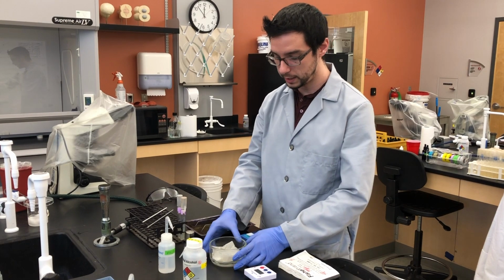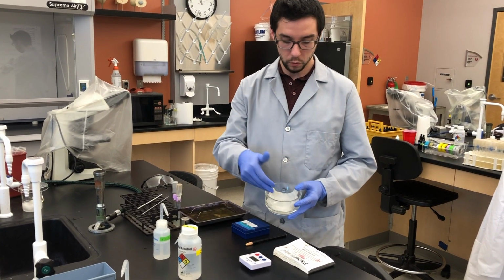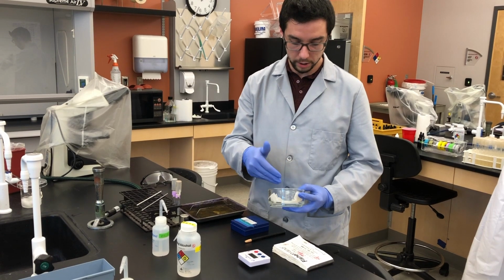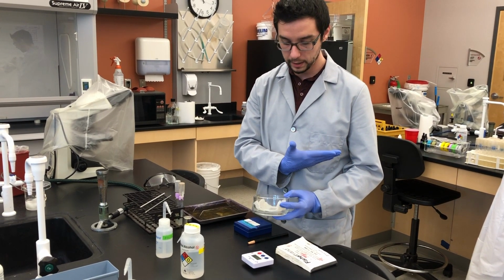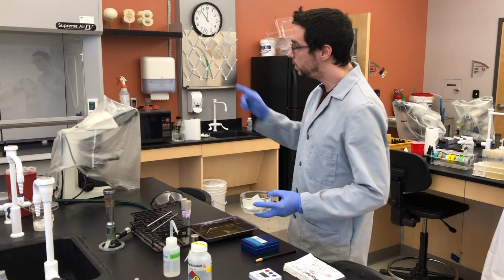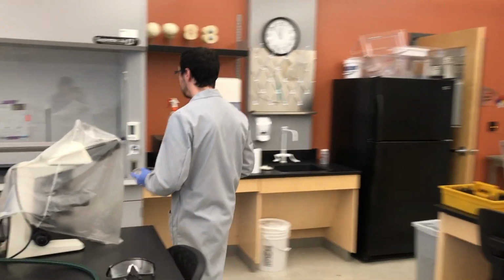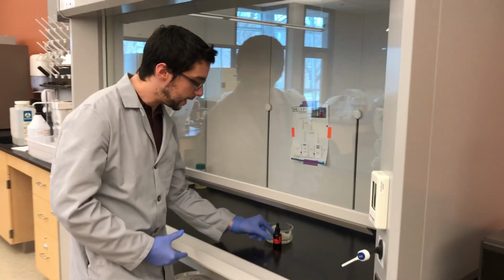So the first step is get your slide in your glass bowl with wet paper towel and water underneath the slide so that there's even transfer of heat across the slide. And then we're going to use the Ziehl-Neelsen dye in the fume hood. The reason for this is the Ziehl-Neelsen dye is not a very fun dye to work with.